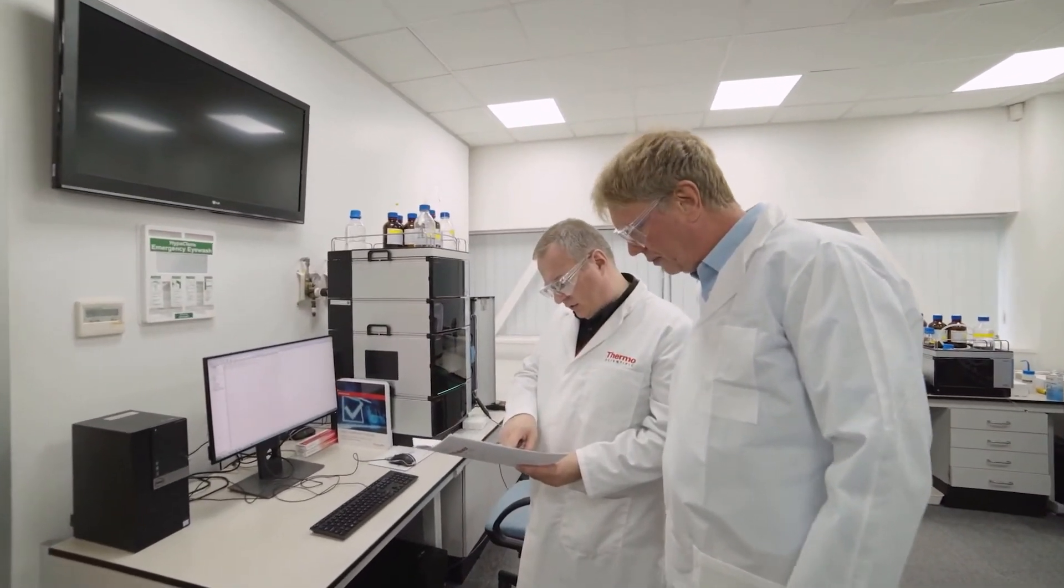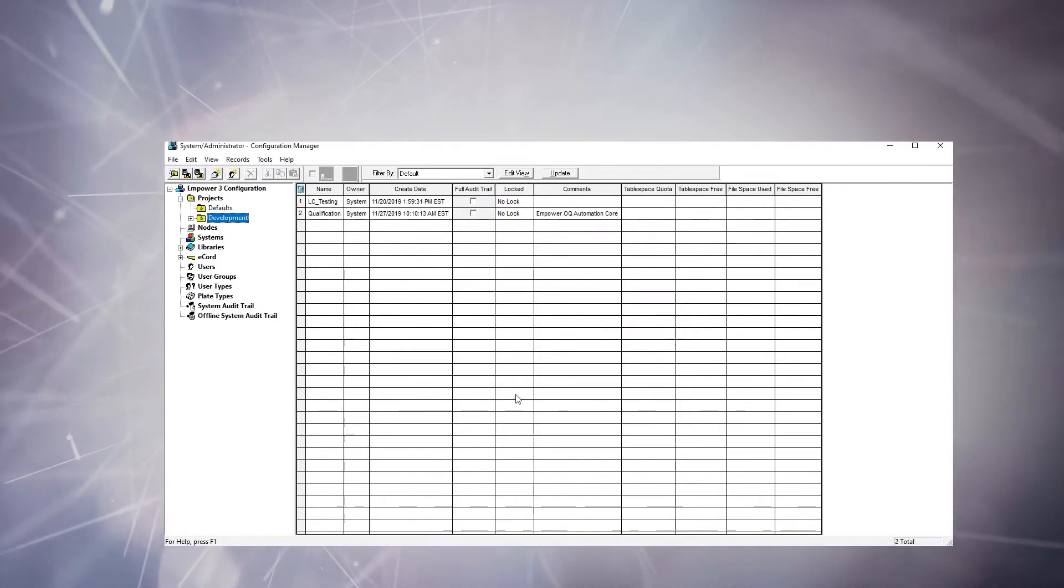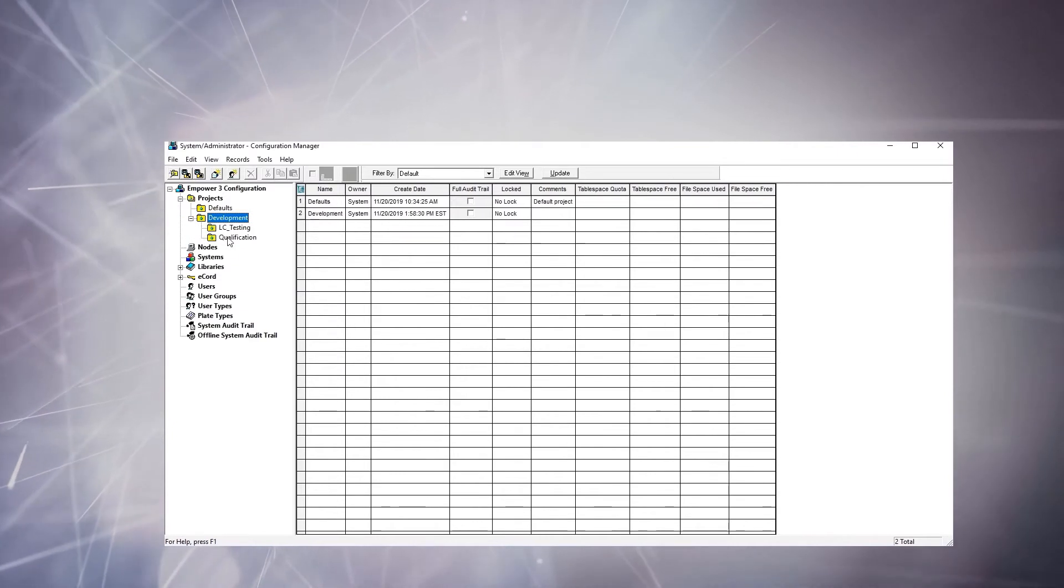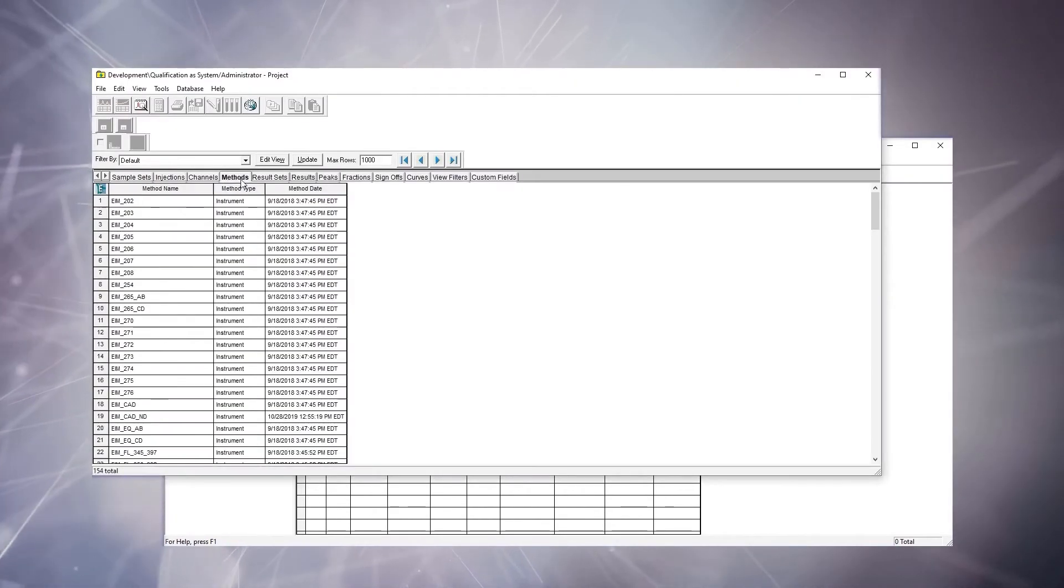Prior to starting the OQ, a template OQ project is imported into the Empower instance used for testing, either through a removable media device or through a cloud-based file share in alignment with required IT policies for system access and permissions.